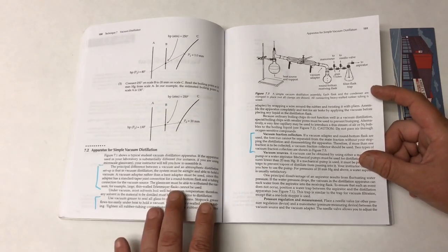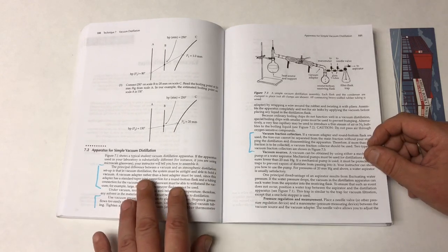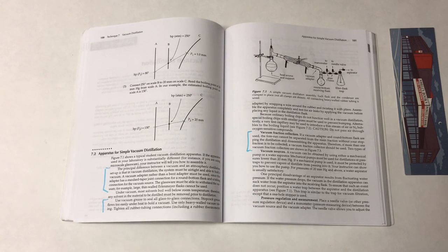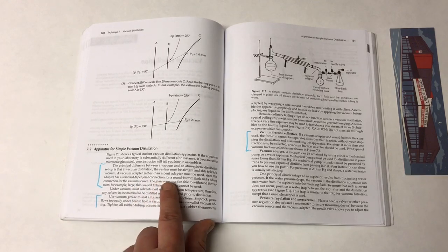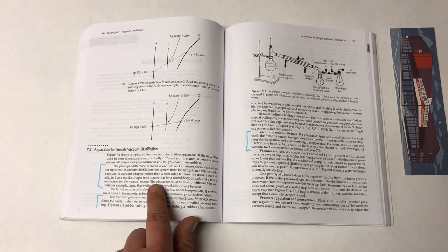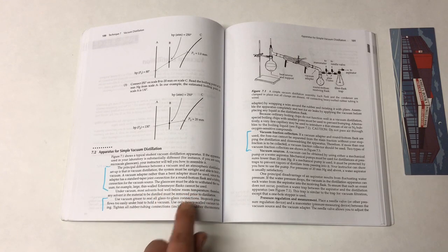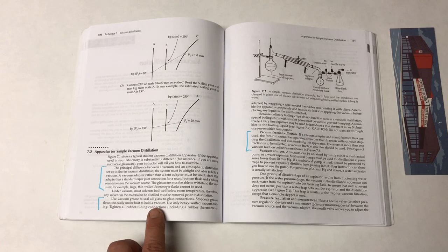The principal difference between a vacuum and an atmospheric distillation setup is that in a vacuum distillation, the system must be airtight and able to hold a vacuum. A vacuum adapter rather than a bent adapter must be used, since this adapter has a standard taper joint connection for a round bottom flask and the tubing connection for a vacuum source. The glassware must be able to withstand the vacuum. For example, large, thin-walled Erlenmeyer flasks cannot be used. Use vacuum grease to seal all glass-to-glass connections.